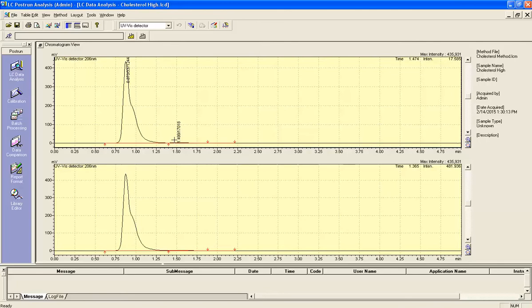Now, there's a 1.499 listed as well. This 1.499 is another peak that the machine has registered. This could be due to some cross-contamination, or some contamination or trash in the mobile phase I decided to use. Maybe I didn't use the purest of the pure, and any of these contaminants will come through on me. Not only that, but the pipettes I use to make the samples could also cause an issue because maybe they weren't completely clean.